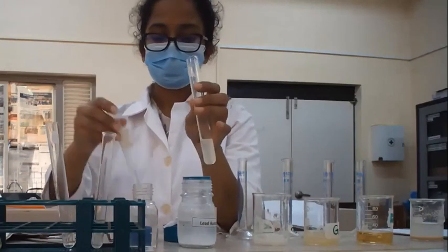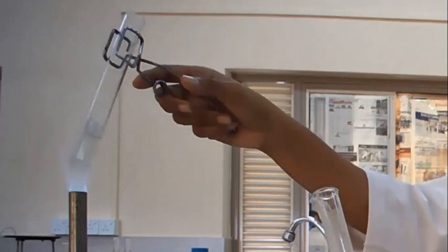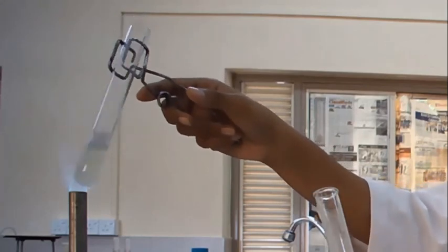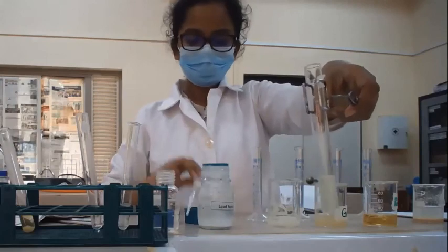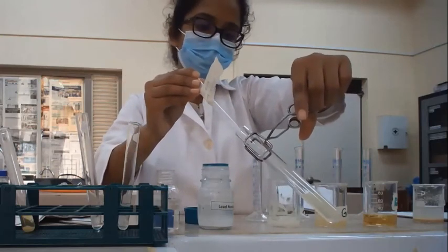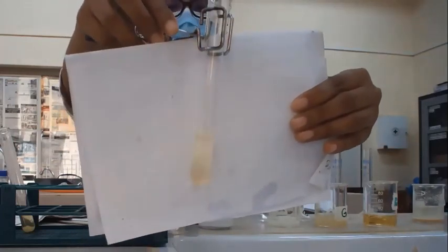Here, I'm going to add a few drops of sodium hydroxide. And I'm going to boil it. After boiling, I'm going to add one or two drops of lead acetate into this test solution. You may observe a white color precipitation in the gelatin also.